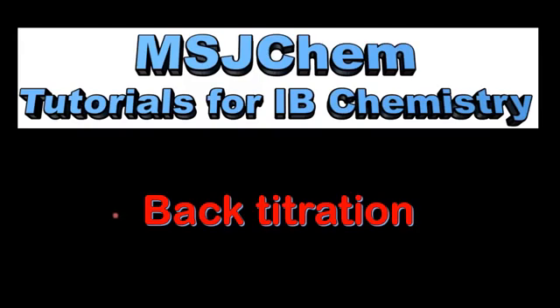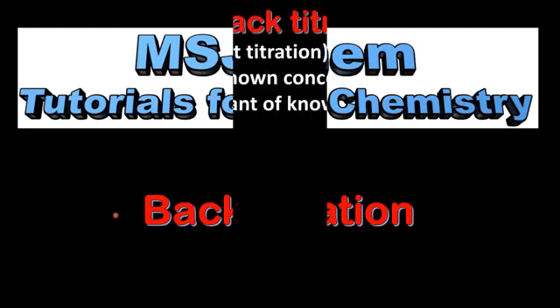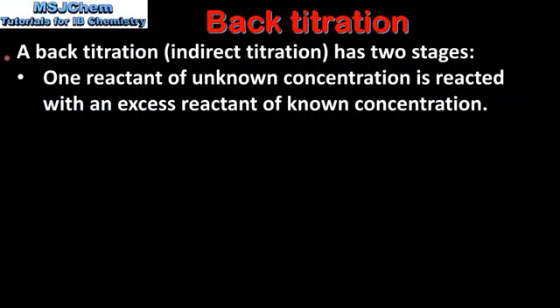This is MSJ Chem. In this video, I'll be looking at the technique of back titration. A back titration or indirect titration has two stages.